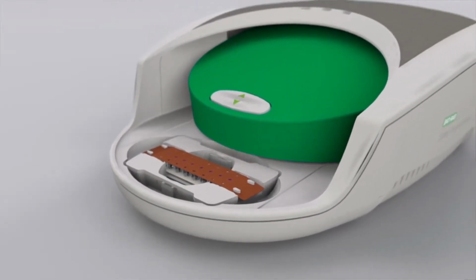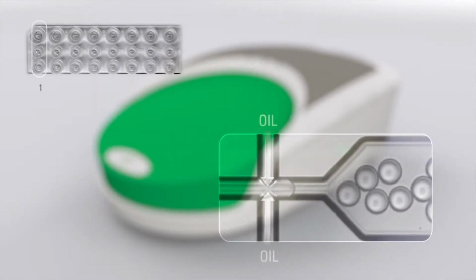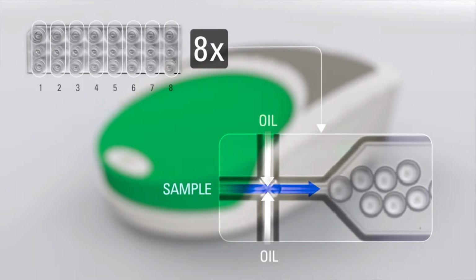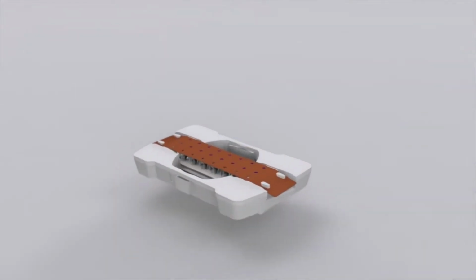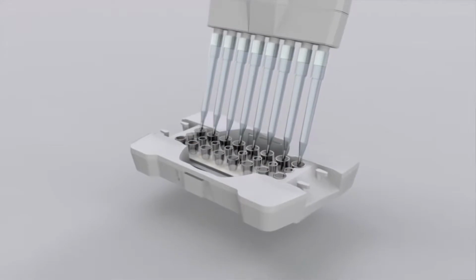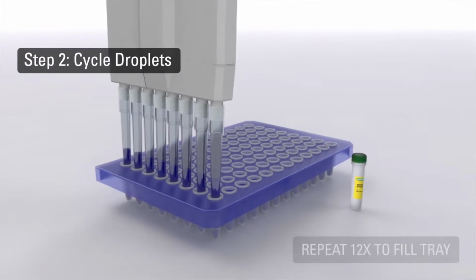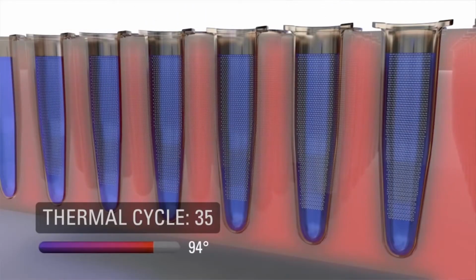The advantage that this instrument has over other machines is that traditional PCR or real-time PCR is just a single well measuring a single product. So one sample is measuring that product. In digital PCR, it takes your sample and partitions it into 20,000 droplets. Each droplet is represented as a PCR reaction, so you have way more power than what you would traditionally have with PCR. In digital PCR, you actually have 20,000 replicates that you're looking at.